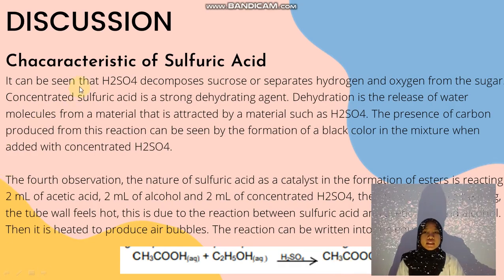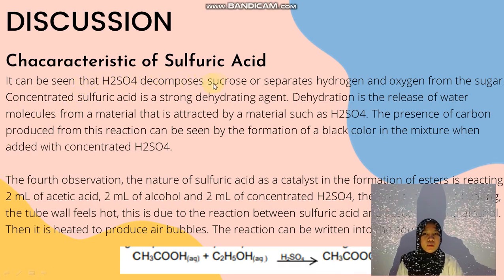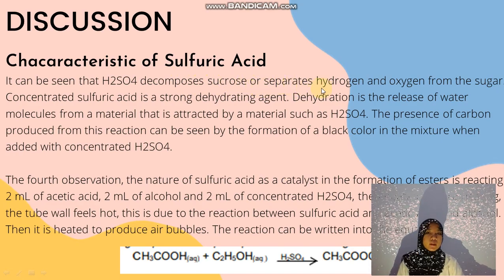It can be seen that H2SO4 decomposes sucrose, or separates hydrogen and oxygen from the sugar. Concentrated sulfuric acid is a strong dehydrating agent.